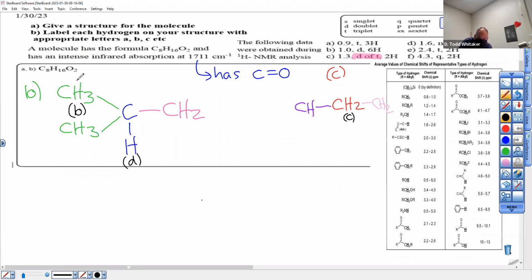I'm thinking esters because 4.3 is up here. 4.3 would be in there. And we can make that work as long as there's 2 H's attached to a CH3. It could be an ethyl ester is a thought. What does he mean by that?